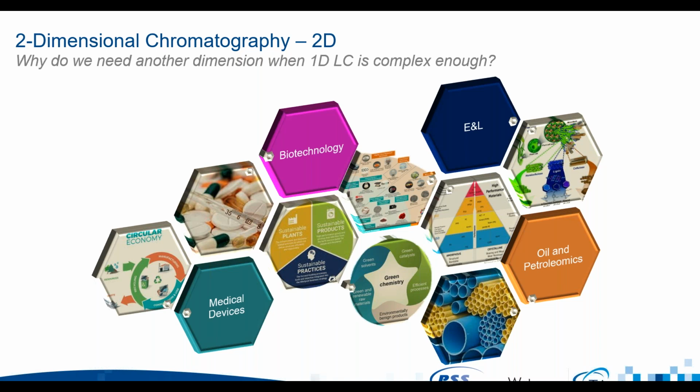So depending on those applications, it can have relevance in the design of medical devices, in extractables and leachables analysis, in the oil and petroleomics industry, and then particularly in things like production of sustainable materials, green chemistry, high performance materials, and our traditional kind of bulk and commodity polymer synthesis and analysis. Essentially, any polymer R&D setting where traditional SEC doesn't tell you maybe enough about your sample.